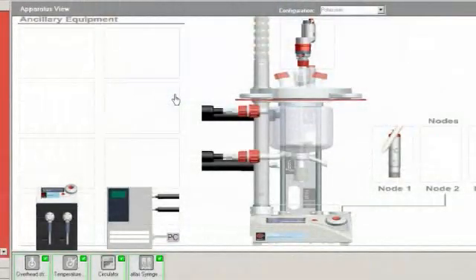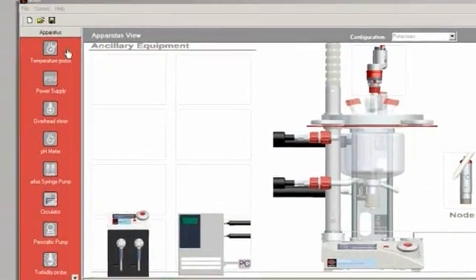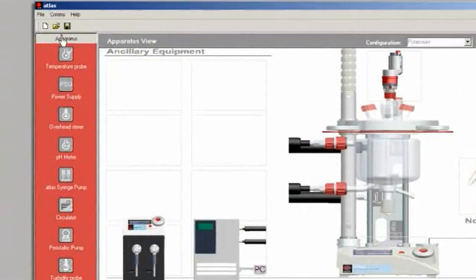The drag and drop interface means process recipes can be created, changed, and saved with the click of a mouse.